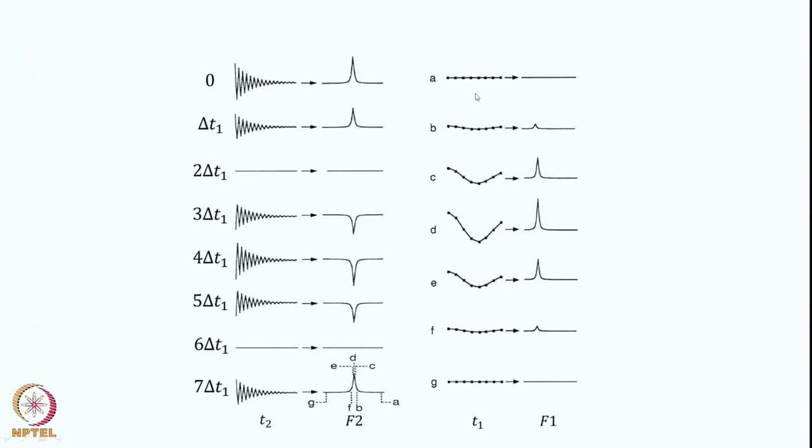Therefore, you see here I have created a time variable which contains frequency information. So, this one is now called the F1 axis. So, I got an F1 frequency axis and I have an F2 frequency axis. These two things are different. So, I have generated a two frequency axis by doing this sort of manipulation, okay. So, this is very important. This point must be very clear before we go forward. I will try to repeat it here so that things become absolutely clear.